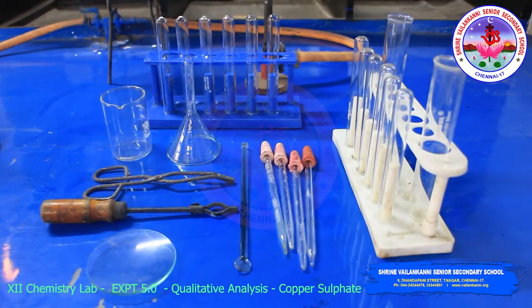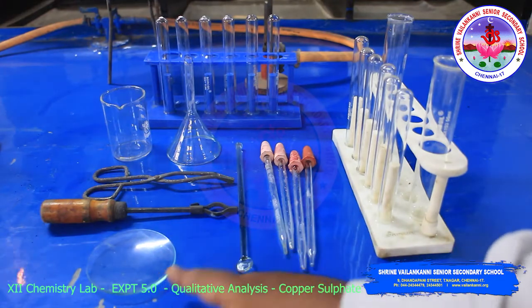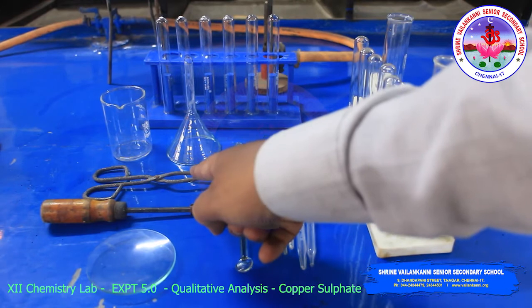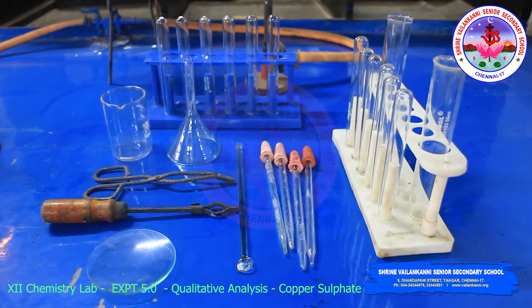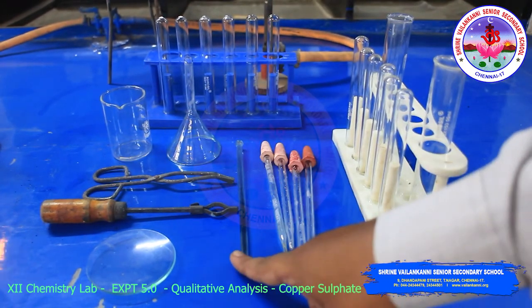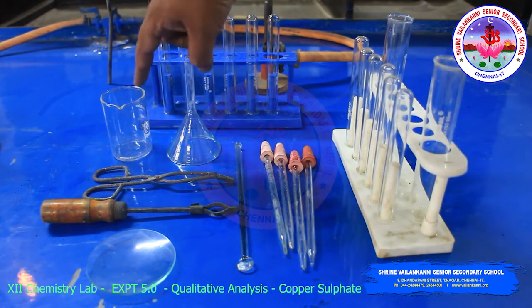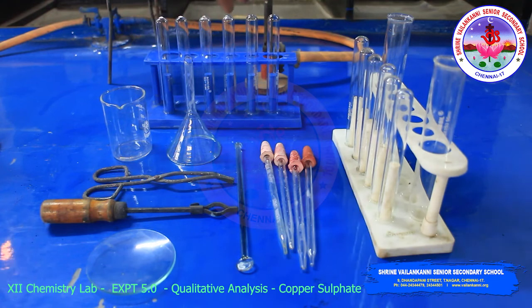Now we will do the experiment, students. Before that I will show you the apparatus for salt analysis. This is a watch glass, this is a test tube holder, tongs, then a glass rod, dropper, beaker, funnel.